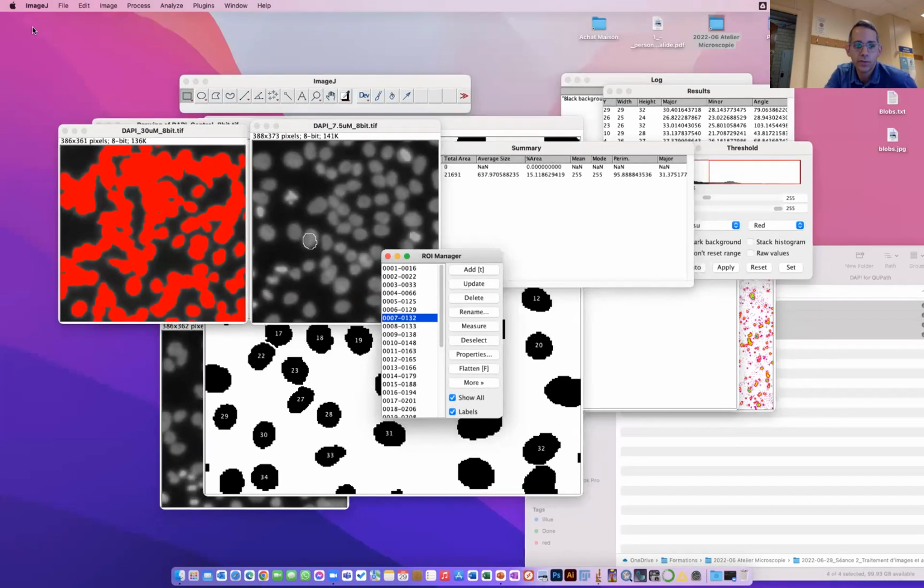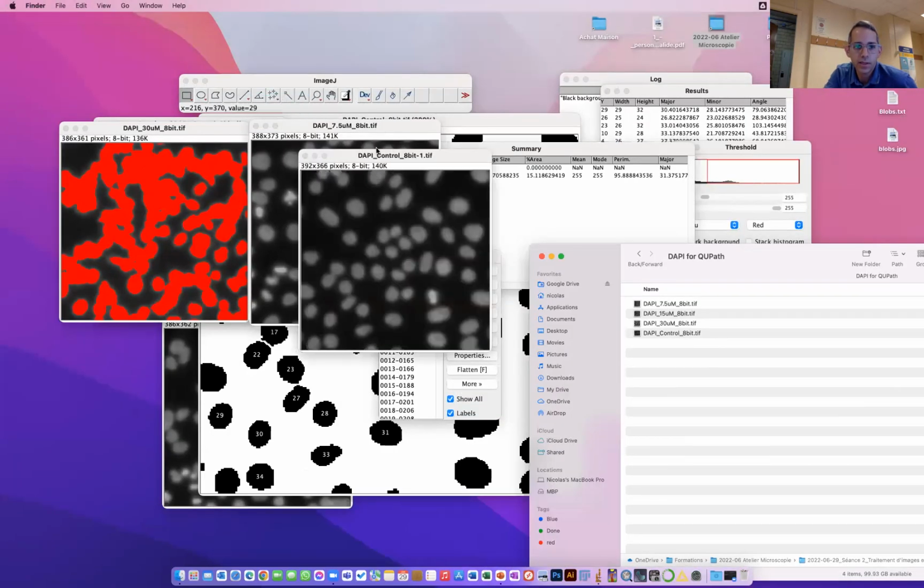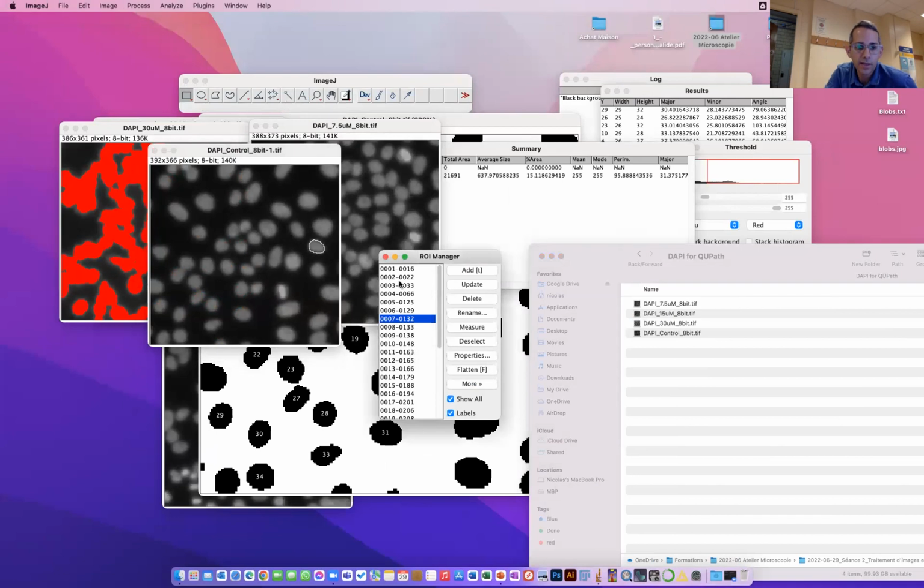And oops, no, this is not my original image. My original image is here. And you can actually go back and say, okay, this is one cell, this is one cell. And you can check if you were correct or not. You can also now measure the intensity within these cells, and for that, you just click measure. So this is what the segmentation gives you: several regions of interest within your image. The main challenge in segmentation is to actually do it in a proper way.